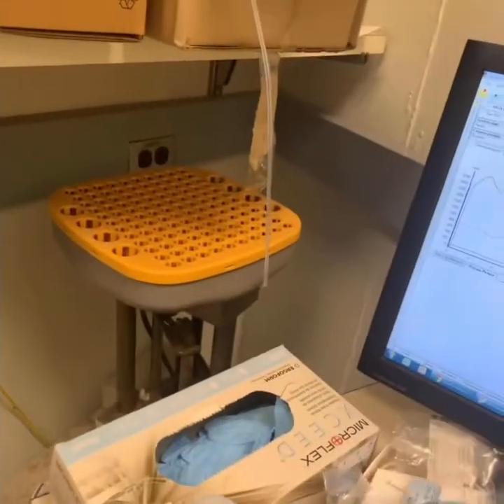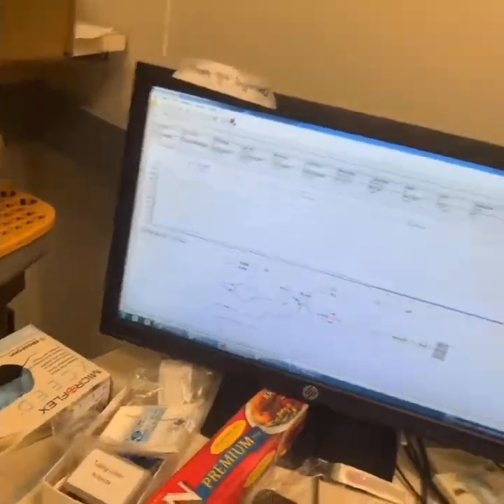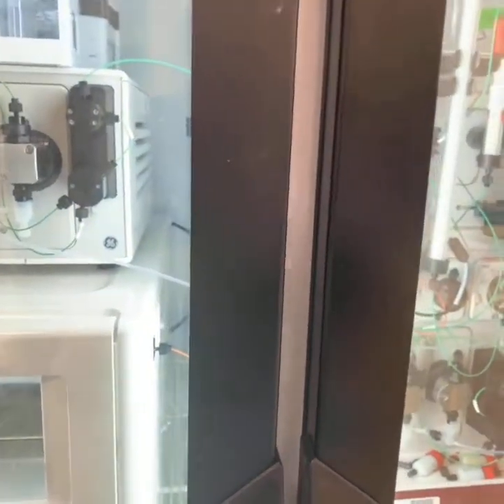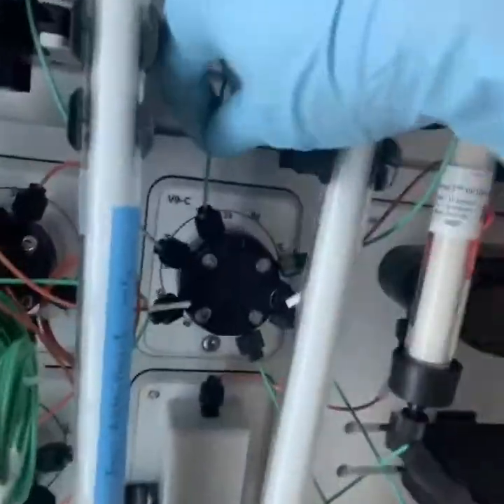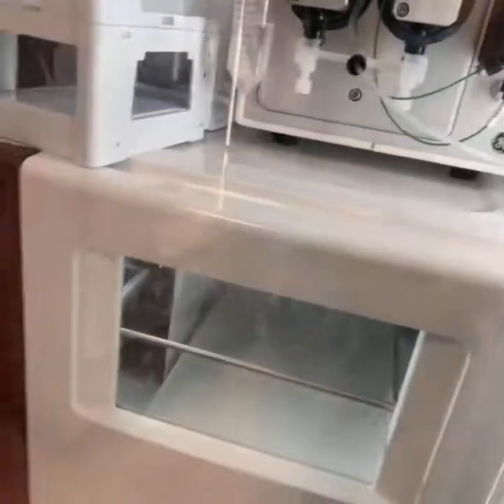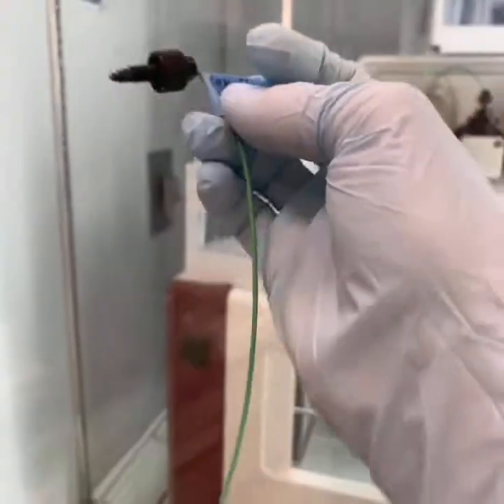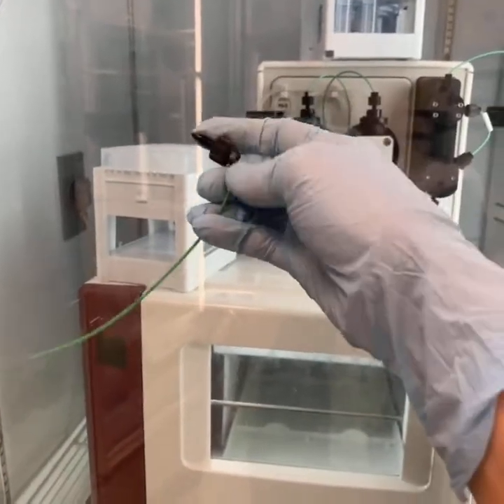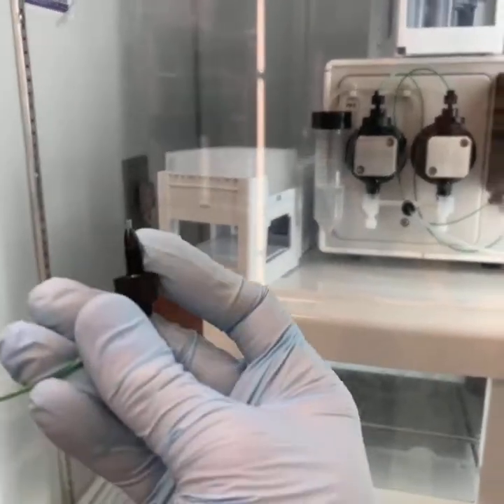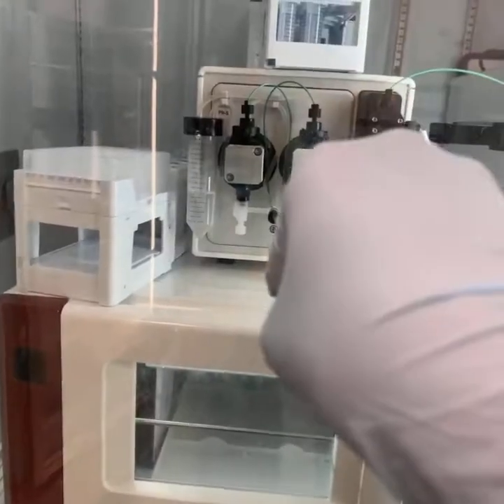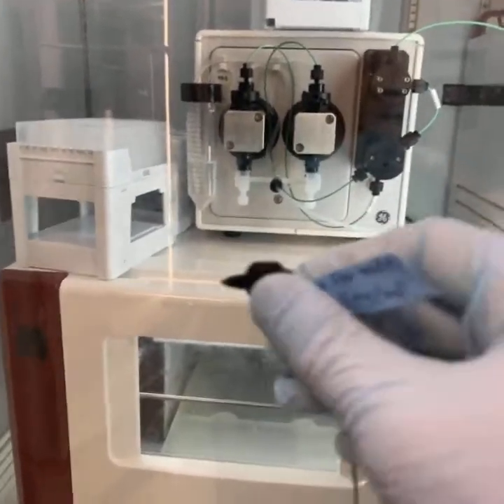Sometimes you'll have problems with the tubes. And so one way to fix it is to snip off problem parts of the tubes that get kinked or stuff. And the other thing is so sometimes the tubing can pop out. So with these, the tubing, when you stick the tubing in, you want to make sure that, so there's different tubing. So the green tubing is one of the common tubings. And then this adapter thing is going to screw in. When you're screwing it in you want to make sure that you have the tubing out. And then you want to push in and really crank. And then after you do that you want to pull out and make sure that it's tight because that can pop out and cause you to lose your protein or stuff. So that's not good.